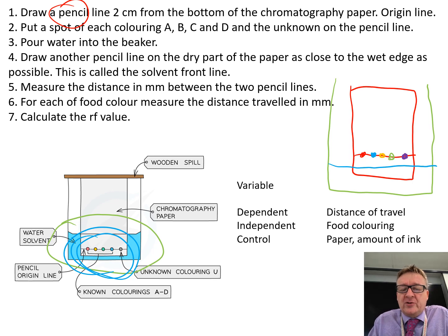Once it's actually worked, draw another pencil line at the top part of the paper as close to the wet edge as you can. If that's the wet edge there, you get your pencil and draw a straight line across using a ruler. That is the solvent front line.